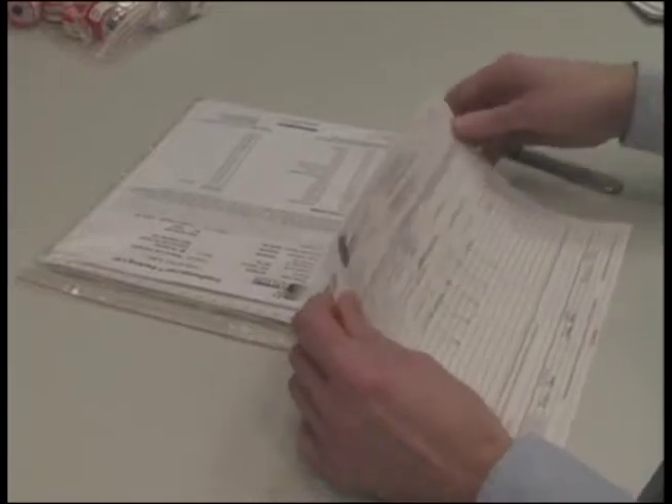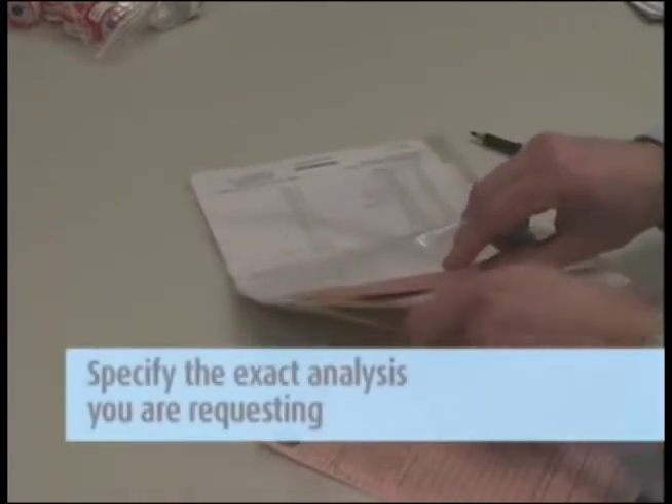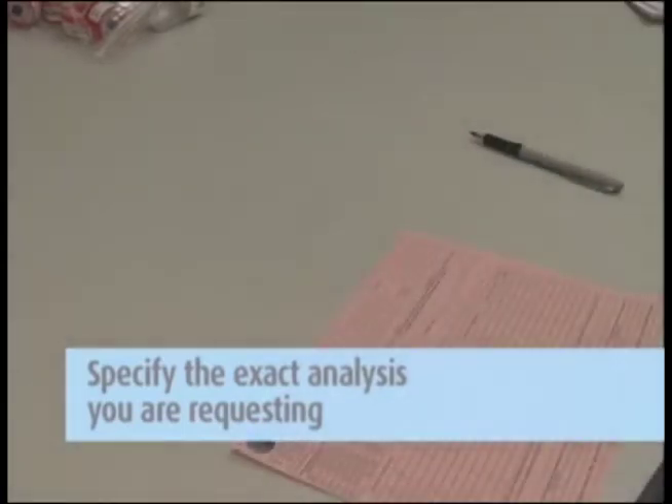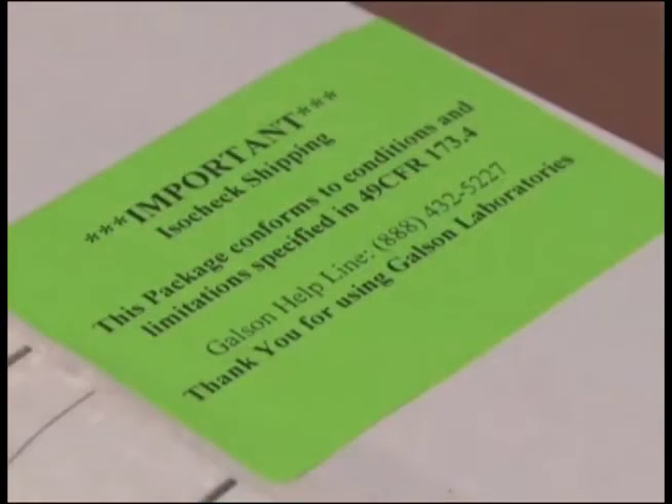Complete the chain of custody form. It is important that you include all the information requested in order to ensure the turnaround time of your samples. Please mark the isomer needed in the analysis requested portion on the chain of custody. Place the blue foam-lined boxes inside the original shipping box.